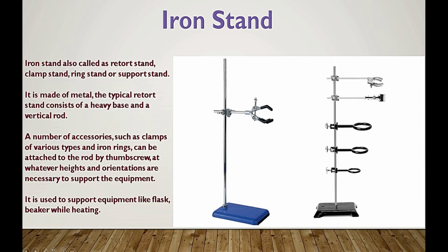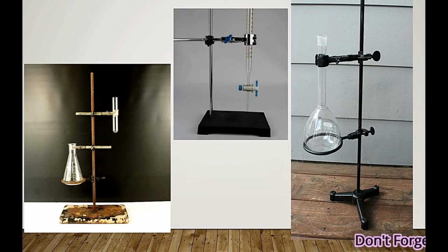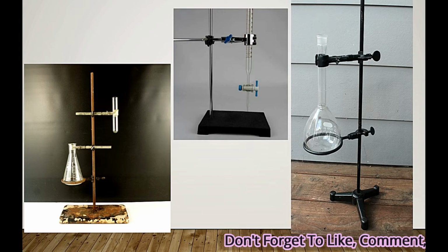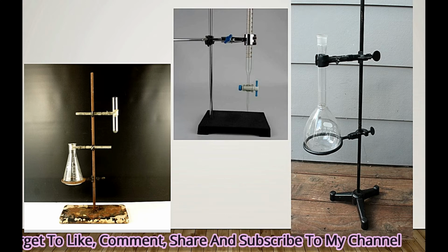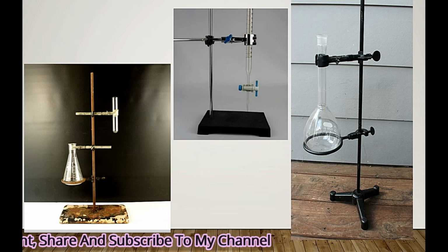At whatever height we want to attach these accessories, we can attach, and we can change the orientation of these accessories also according to our need and to support our equipments. It is used to support different equipments like beaker, test tubes, flasks, etc. while heating or performing some practical. In these pictures, you can see different uses of iron stand. So it is very useful equipment in chemistry lab.